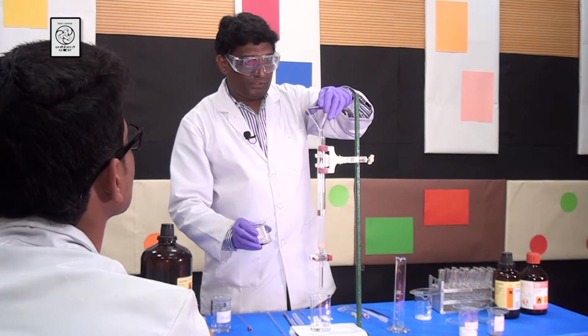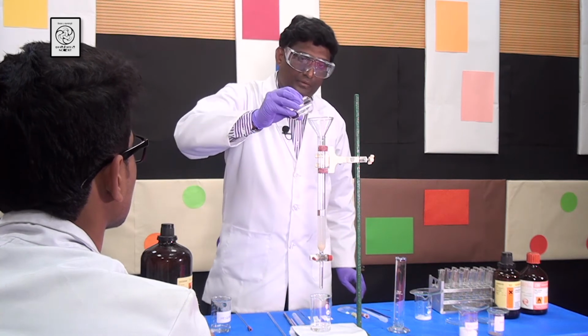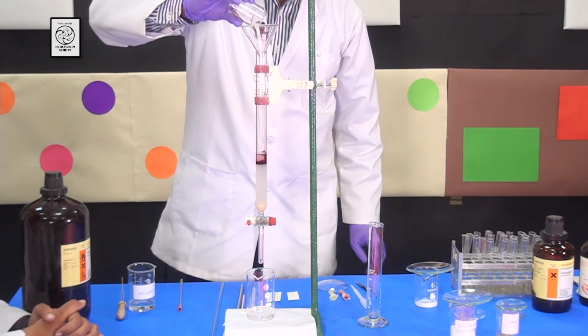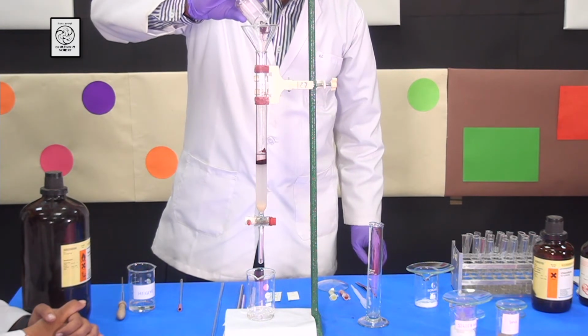So I am going to put the funnel on the top of the column and slowly pour the compound into the column so that it can settle down nicely.